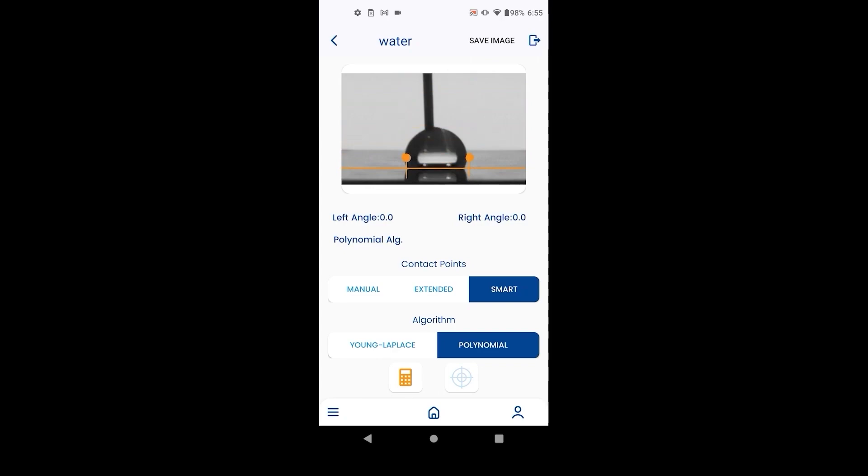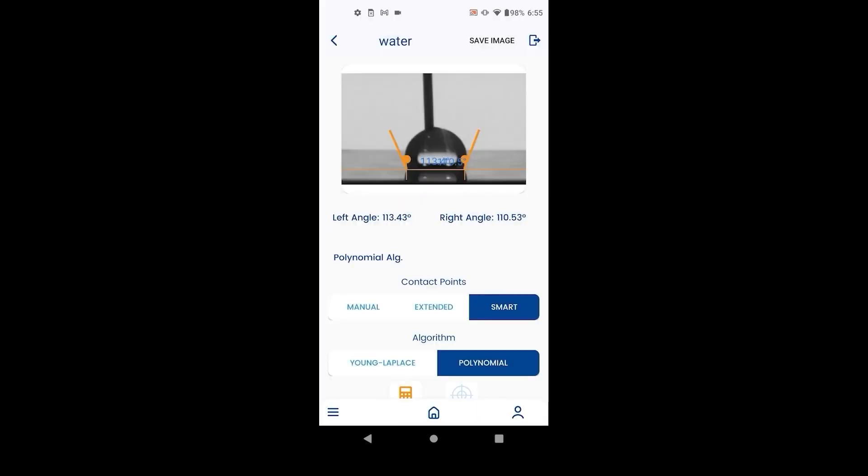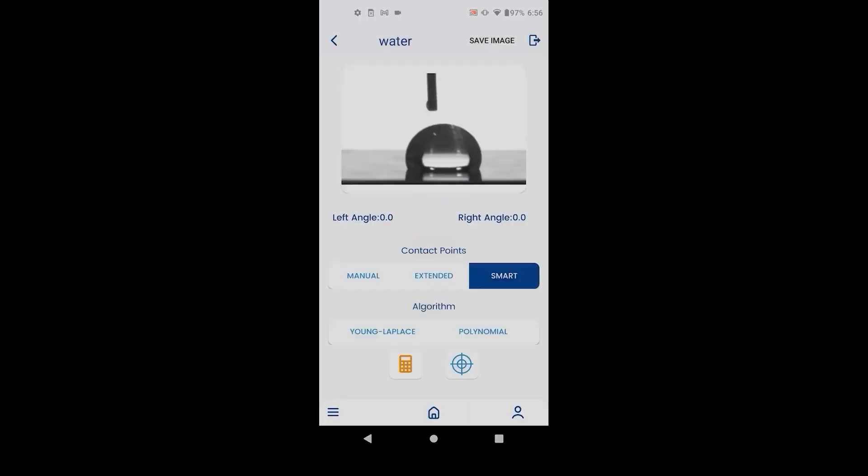When selecting the baseline, be careful to not mistake the droplet for its reflection. This can be a problem with contact angles around 90 degrees. Hit calculate once everything is in position.